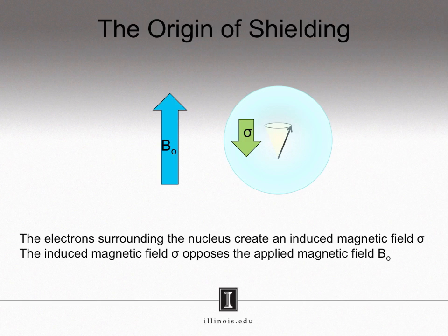However, if you recall the general chemical shift table from a while back, you know that alkenes and aromatic protons are even further downfield, yet those don't have any electron withdrawing groups. This has to do with an idea called anisotropy. We will not discuss anisotropy in this course. Simply know that anisotropy exists, and it explains why hydrogen atoms that are part of alkenes and aromatic rings appear farther downfield than hydrogen atoms near electron withdrawing groups.